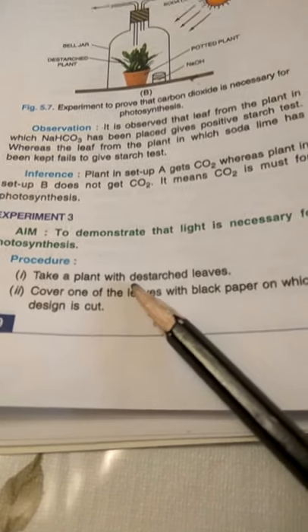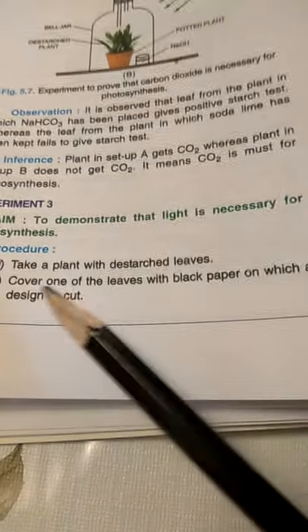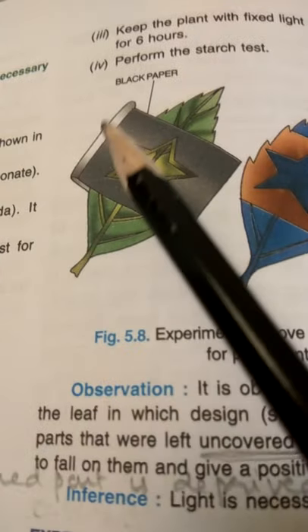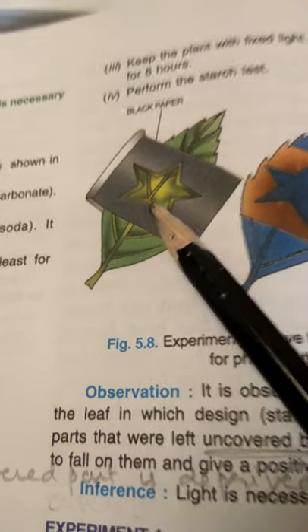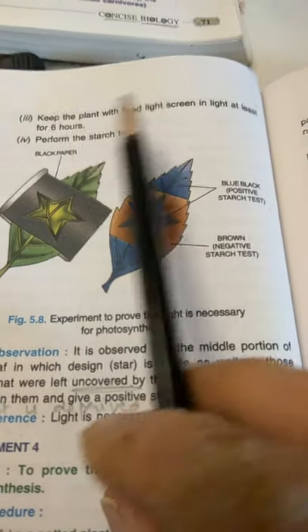After that we'll take out that plant and cover one of the leaves with black paper on which a design is cut, so only one leaf is covered with the black paper and a star-shaped design is cut in the middle of the paper.